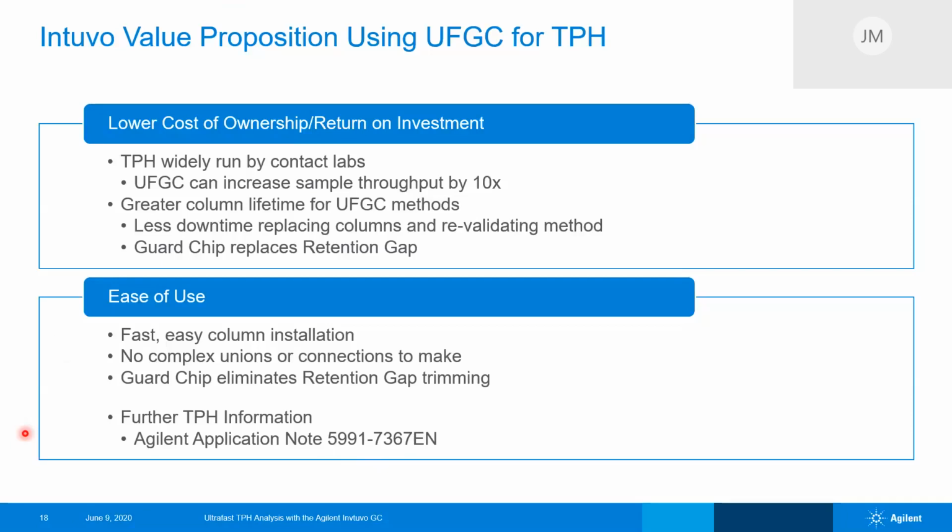What we could do is just leave the hold up time or the linear velocity the same as the helium. And in that way, we won't get any difference in retention time. So it'll all be roughly the same, just with the hydrogen carrier gas. There may be actually a way to do a little bit of speed improvement again with hydrogen.